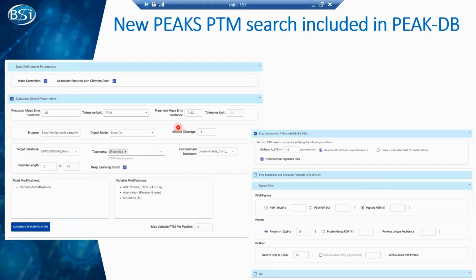The PEAKS PTM workflow is the same. The first thing is the normal DB search parameters, as in our normal common search workflow. You input all the things here, and then here is the new PEAKS PTM search.